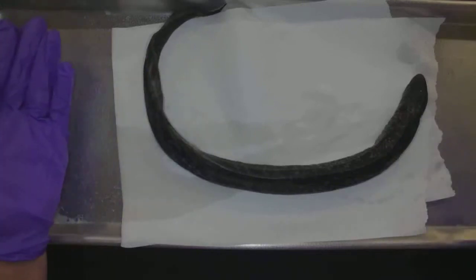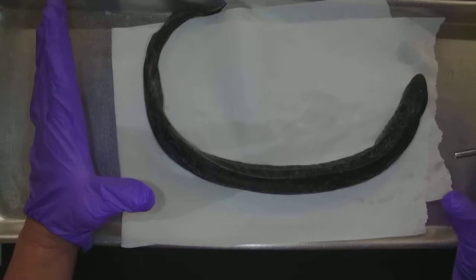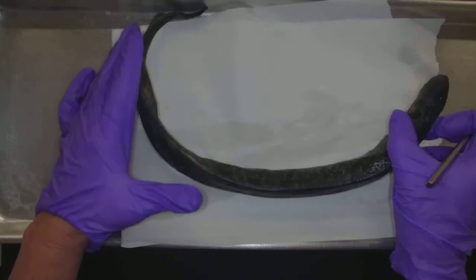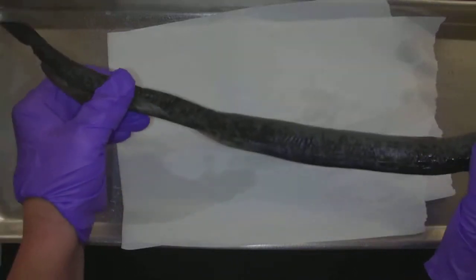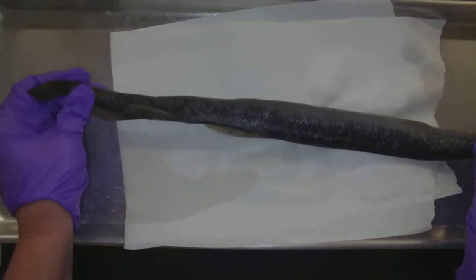This is a lamprey. So cool. Subphylum vertebrata, the cyclostomata. This guy does not have bones — it does have cartilage inside of it.